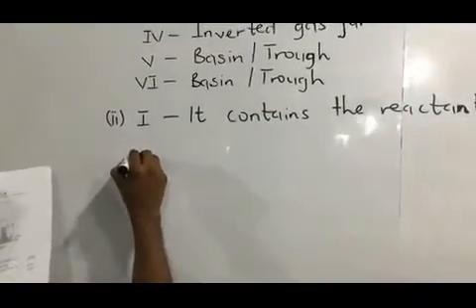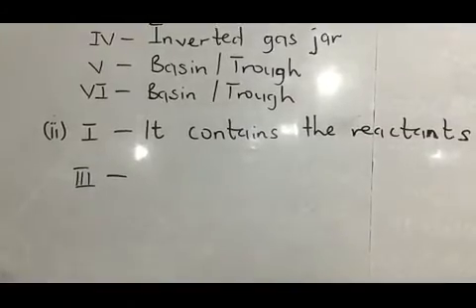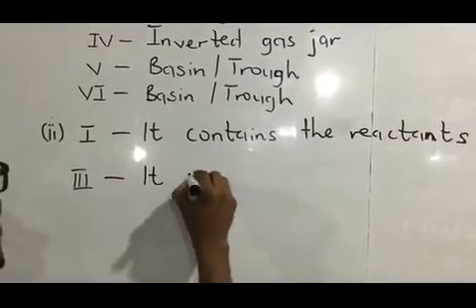Then the function of III, the delivery tube.